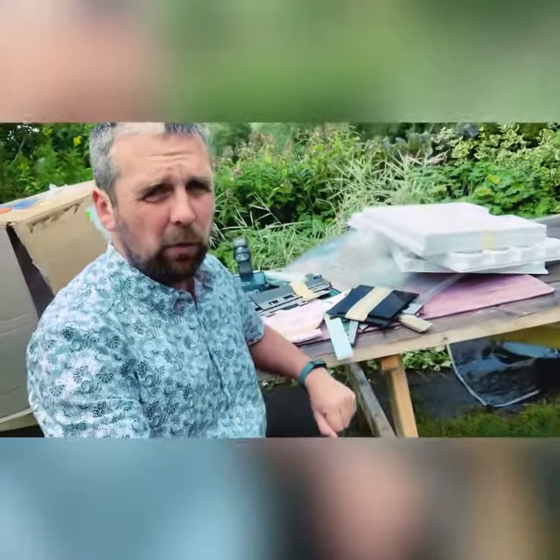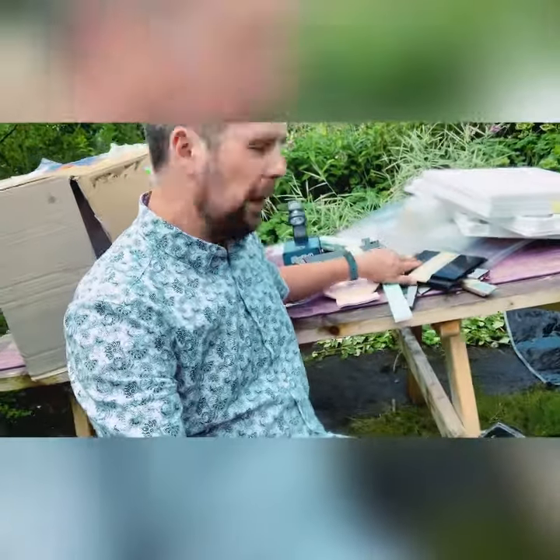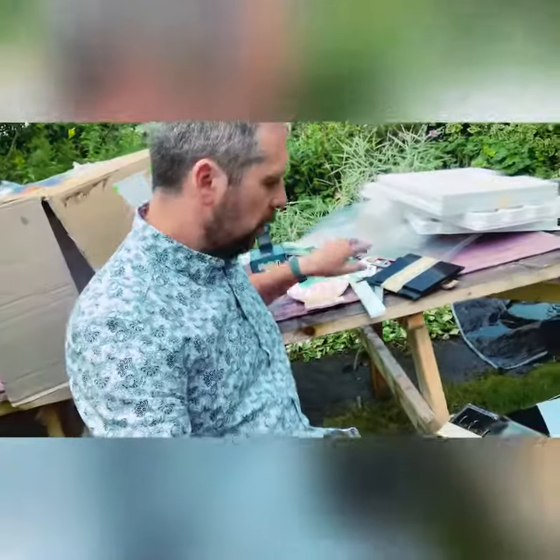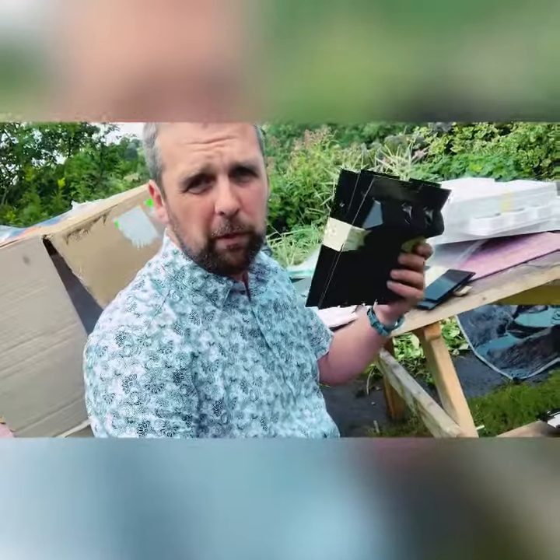It scanned almost all the samples we sent — all the whites, all the clears, even this one black sample of acrylic. All these whites, some of the more difficult ones, some of the more reflective ones — got good reads on them all. The ones it didn't do, which we sort of knew was going to happen, was the darks — the polystyrene darks. So yeah, very successful.